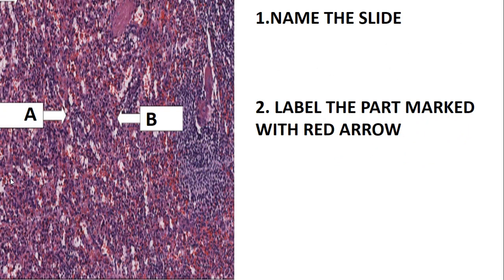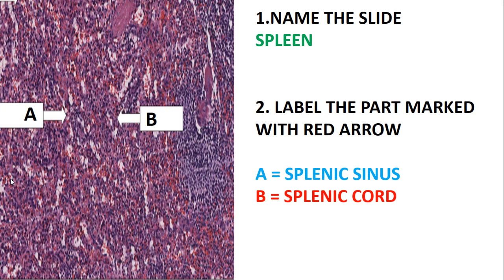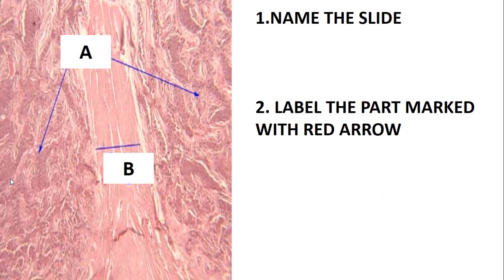Name this slide — this slide is the spleen. Right now we are looking specifically at the red pulp and its contents. The red pulp contains the splenic sinuses, which consist of blood vessels and blood cells, and the splenic cord, which contains macrophages, sinusoids, lymphocytes, and many other components. Label the parts marked with letters: A is the splenic sinus and B is the splenic cord.